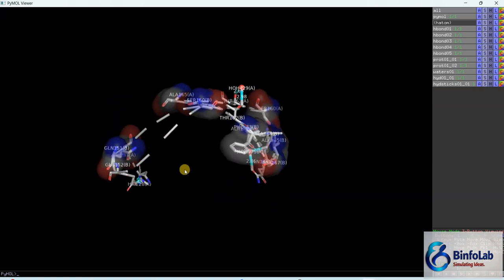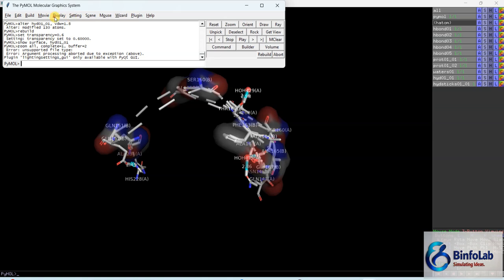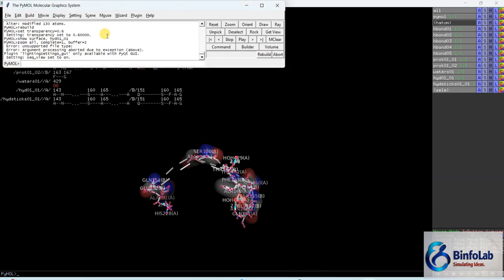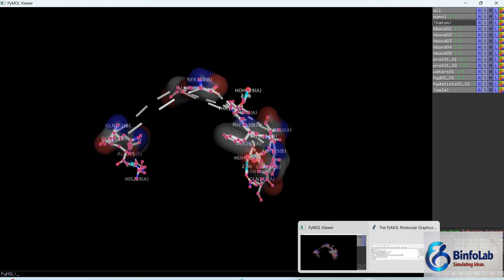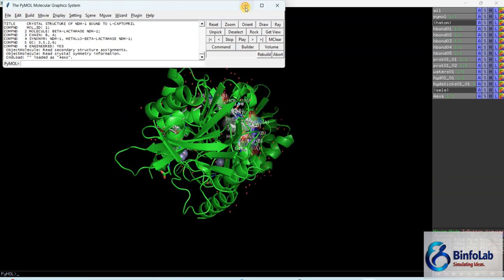Now here they are telling you what you can turn on the display setting. Okay, so they are telling you which atom is from chain A, what residues are from chain A and what residues are from chain B. You can do also another thing, just let's play smartly. What to do? In the same PyMOL window, just open a real protein. Now, can you see?